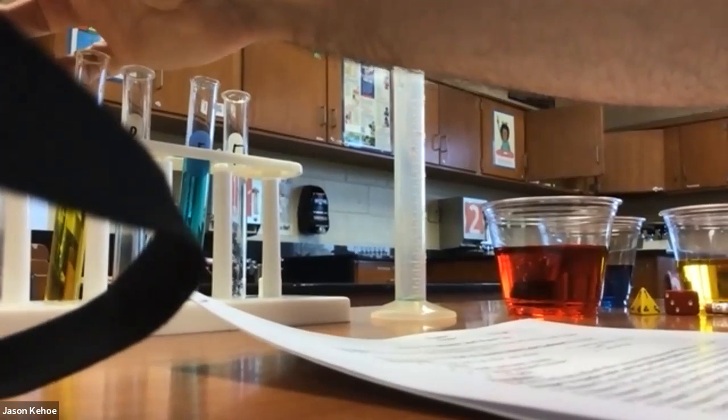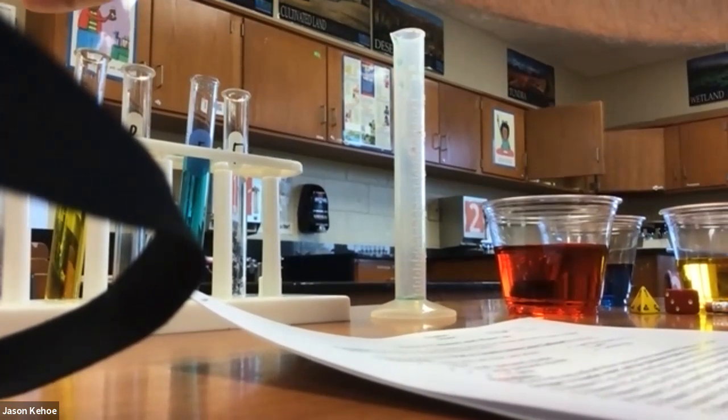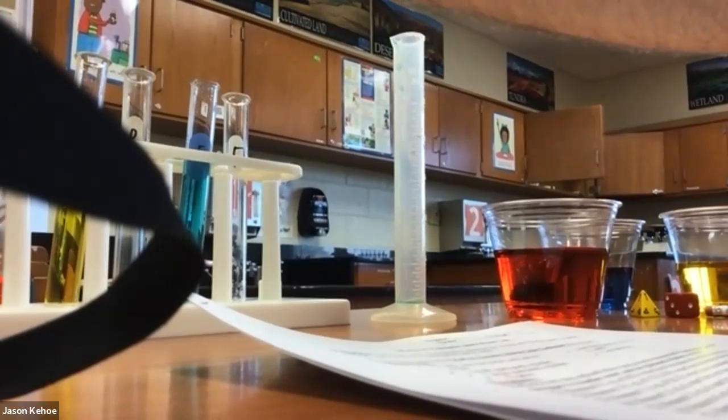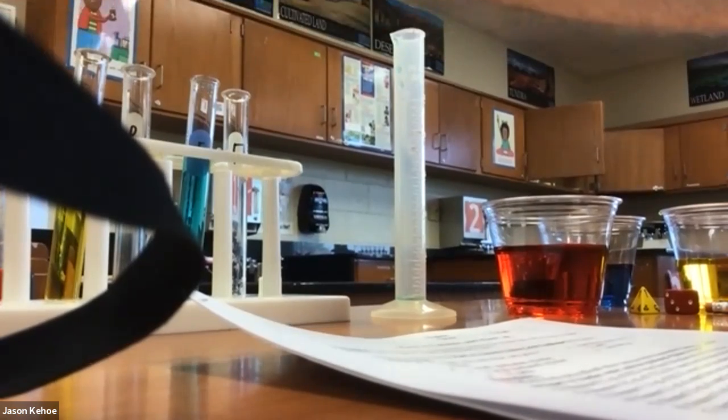It's a little tricky to get it to go all the way up that high. I'm just going to do 2 and then I'm going to do a 0.5 because I can't get it to go up all that high. I'd have to squeeze it a lot. From A into B, so there's 2 milliliters and 0.5.